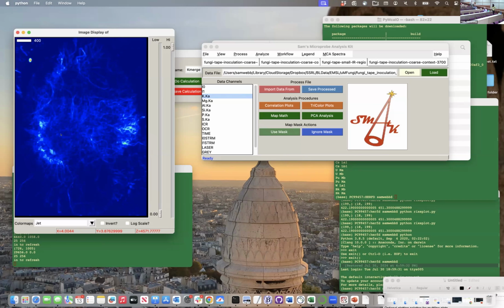So I have some notes on some of these things. I also have how you can install a desktop icon to run it from your desktop. We have some of this, it's just not out. If you do want some of these notes, then I can also share those with you.